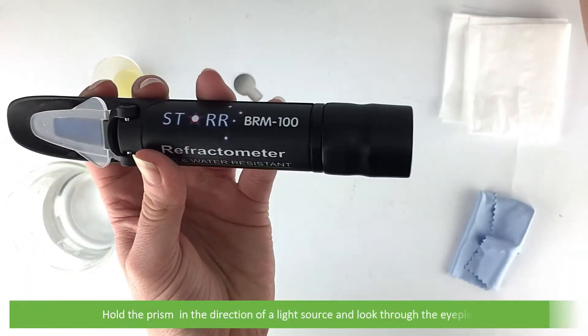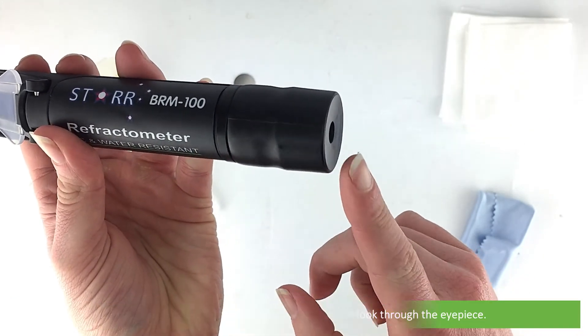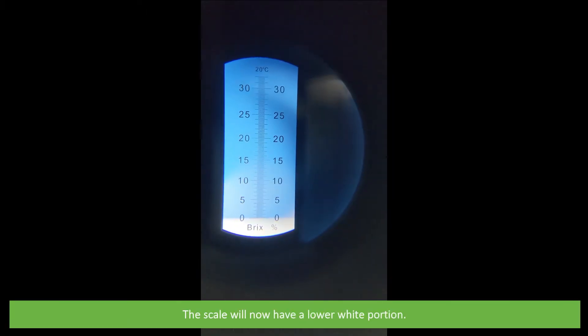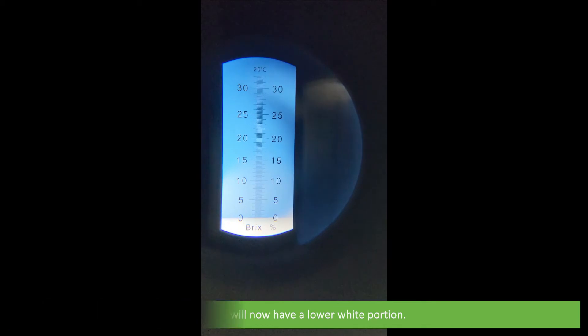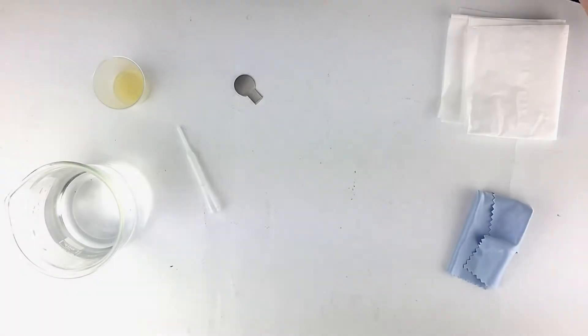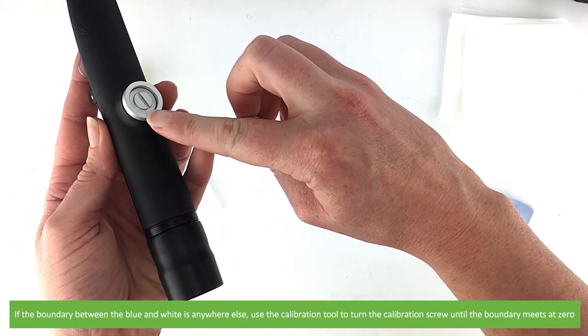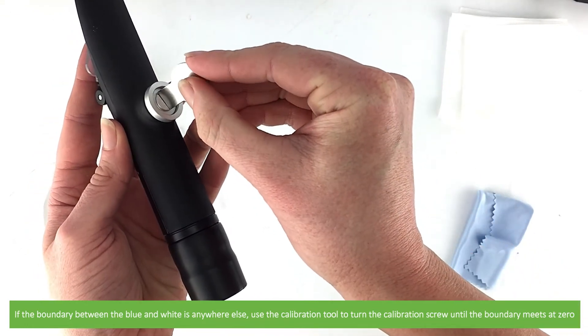Hold the prism in the direction of a light source and look through the eyepiece. The scale will now have a lower white portion. The white and blue portion should meet exactly at the zero marking of the scale. If the boundary between the blue and white is anywhere else, use the calibration tool to turn the calibration screw until the boundary meets at zero.